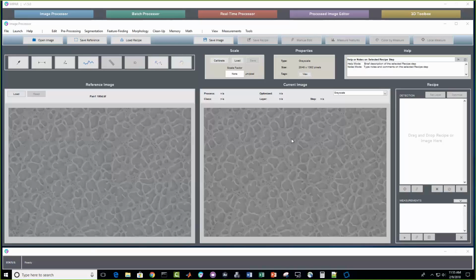They've got a peer-reviewed paper now that is out for publication, and we are very excited to have collaborated with them and are confident that a combination of their new imaging technique with a MIPAR recipe, which they include in their paper, can very likely become the new standard for gamma prime measurements in nickel-based superalloys. So I'm very grateful for Tim's permission to share this with you today.